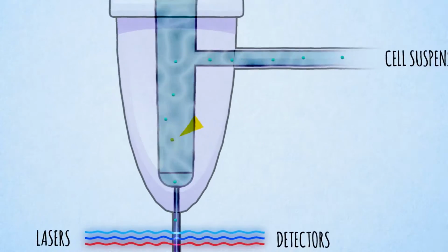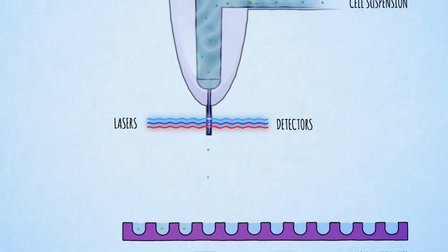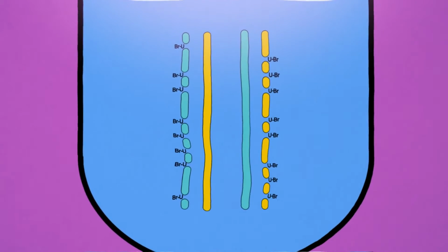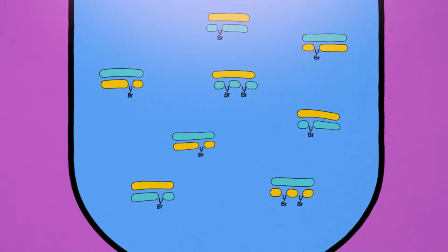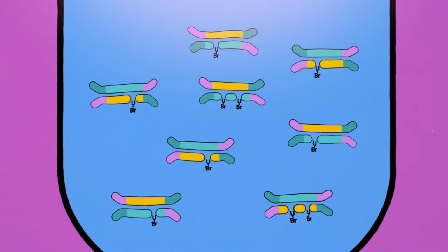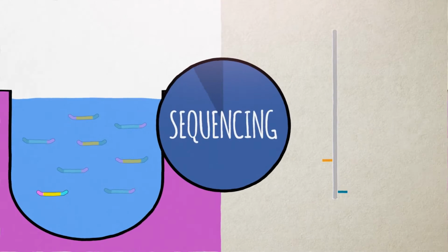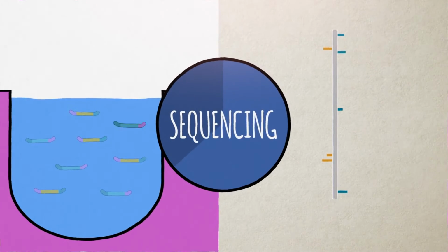In order to detect inheritance of template DNA strand at the single-cell level, single cells are sorted by means of flow cytometry. The DNA is extracted from each cell and then fragmented. These DNA fragments are further processed for sequencing. The BrdU-labeled DNA is removed, leaving only the original template strand behind. Each DNA fragment is then amplified, sequenced, and aligned to the correct location in the genome.